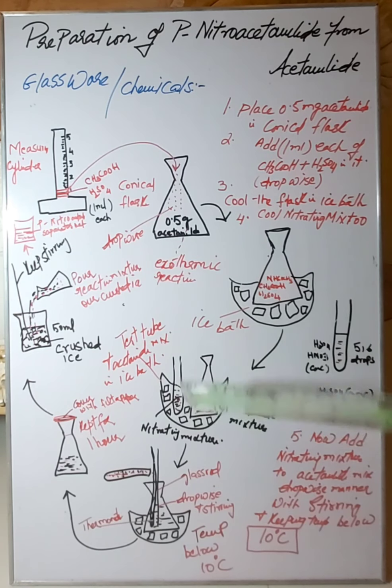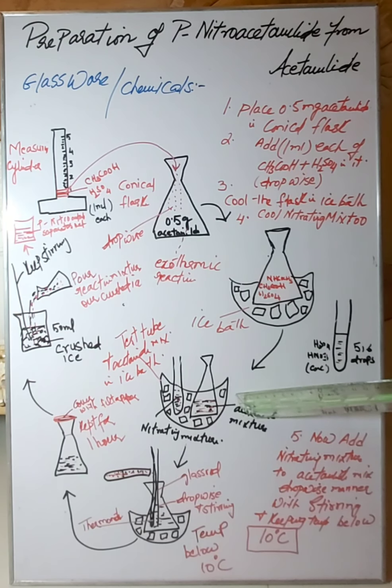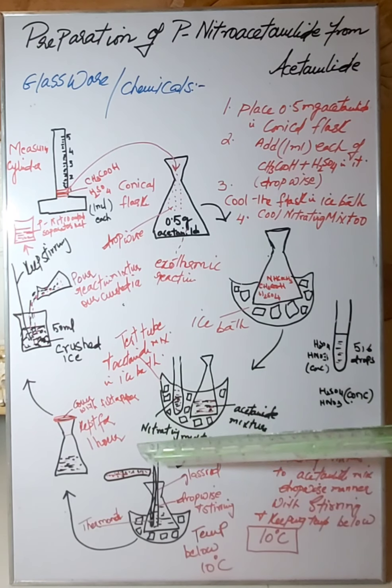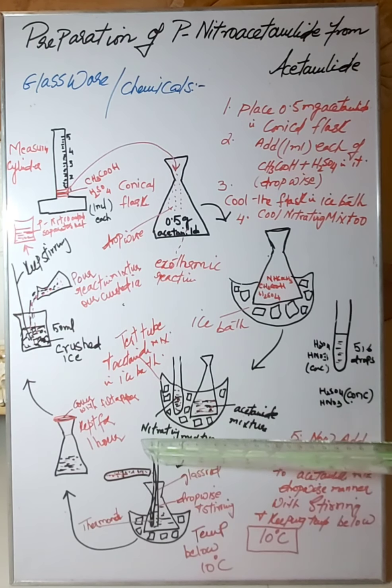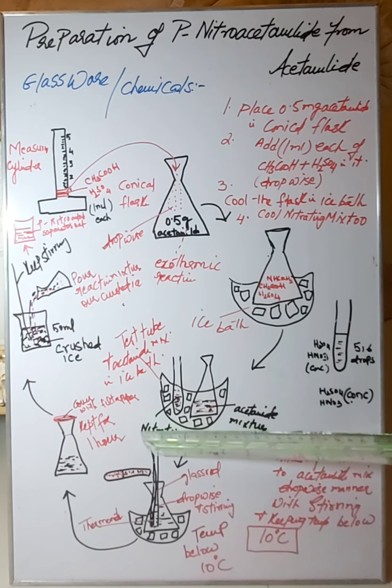Just go dropwise and take your time in adding these two mixtures together, and keep on stirring, keep on shaking the flask when you are adding the nitrating mixture into the acetanilide mixture. You have to put a glass rod inside it for the stirring. I can show you here, there's a glass rod for stirring. You will never stir an organic mixture with a metallic spatula. Always use a glass rod, never a metallic spatula.